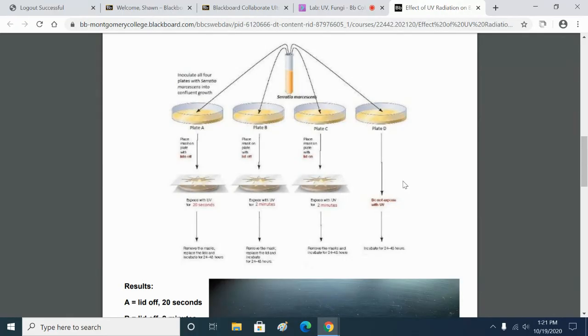But the D1 strain does produce the red pigment, but not at 37 degrees Celsius. You need to be at 30 degrees or lower, like room temperature, in order for the bacteria to produce the red pigment. So it's an interesting example of temperature-dependent gene regulation.